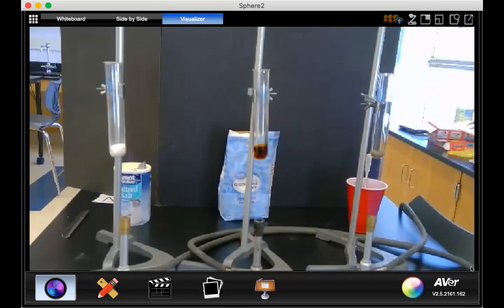Now we're pretty much just past the 1 minute mark, so you can record details. Again, not a lot to see in regards to the salt. The sugar has got some action happening though, doesn't it? And then as you look, it's tough to see much occurring in the lead.